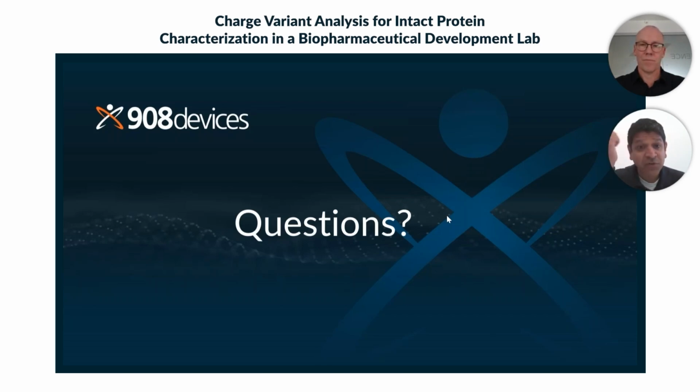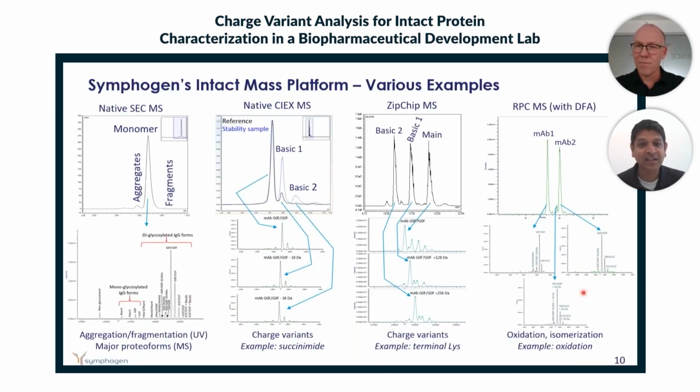Right, so I think there's one question related to your CIEX-MS. On slide 10, how was native CIEX-MS performed? CIEX has a lot of salt in the mobile phase, which is usually not compatible with the MS instrument. Yes, sorry, we're moving away from the zip chip.